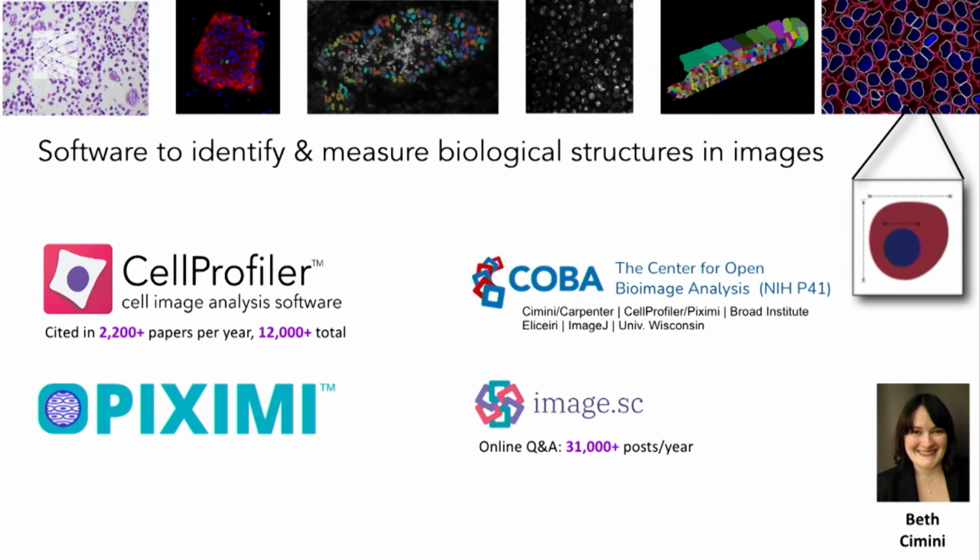If you're familiar with high throughput imaging being used in drug discovery, it's probably going to be in the context of high content screening. That term refers to the idea of using a microscopy assay as a readout for some particular biology that you care about. This field has really matured over the past 20 years or so, to the point where it's now quite routine to do this in mammalian cell types. There are really challenging edge cases, like some neuronal cell types that are really hard to trace. There are fancier and fancier physiologically relevant model systems like 3D and time-lapse that can be really challenging to quantify.